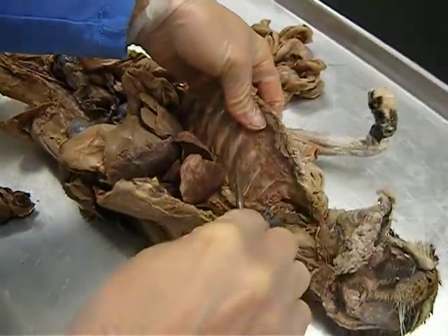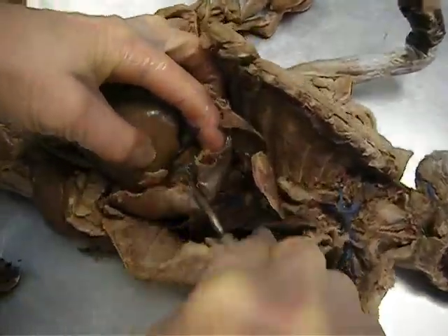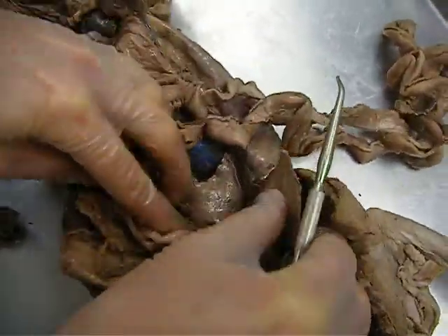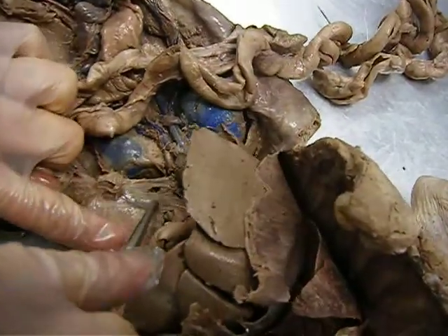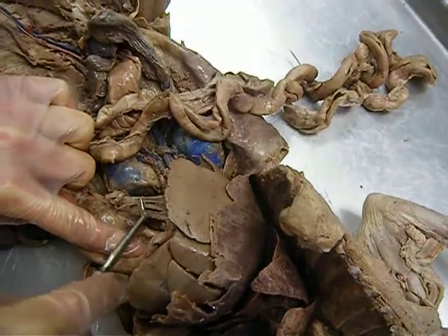To start the lowers, we have intercostals between the ribs. Between the diaphragm and the liver is the phrenic. Between the liver and the intestines is the hepatic portal. It's brown on yours.